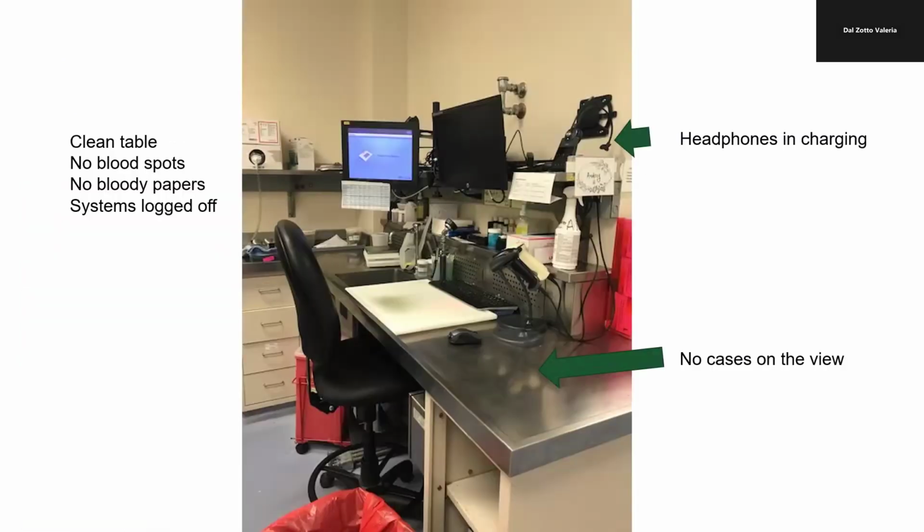This is an example of an excellent table. It's clean. There are no cases in the view. The headphones are in charging. Please make sure when you finish the day, the headphones are in charging, because for the following day of grossing, you are not going to have headphones charged. So you are not going to be able to dictate your cases. You may need to type them. So that is more time consuming. No blood spots, no bloody papers. The systems are logged off when you finish. So make sure that everything is logged off, everything is clean and neat, and the headphones are in charge.